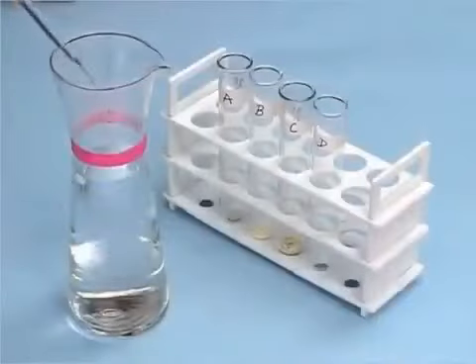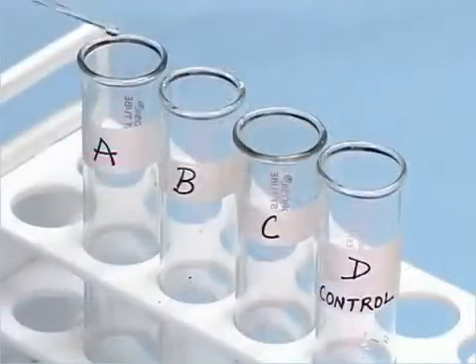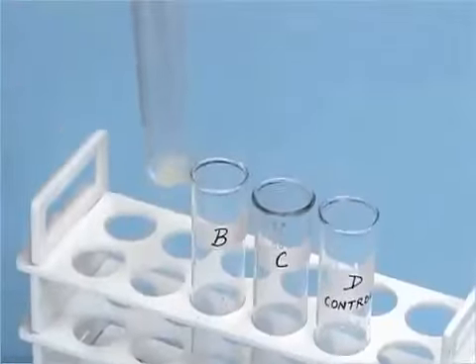Then add a few drops of water in each test tube. Shake all the test tubes well.